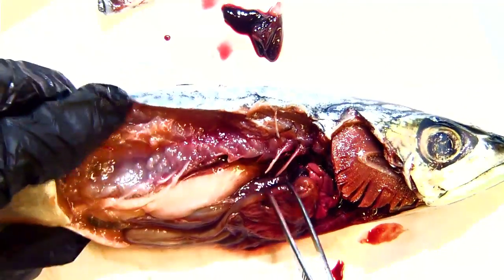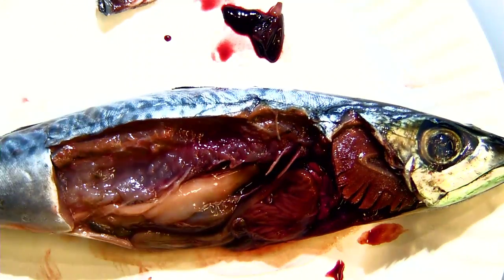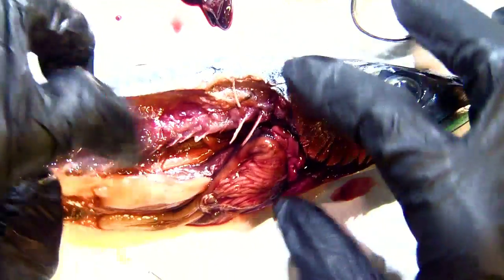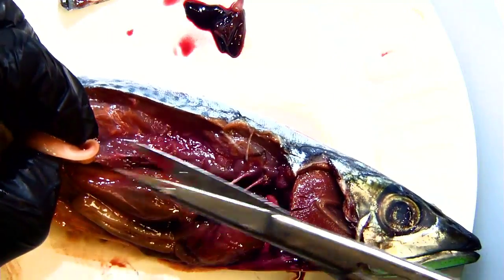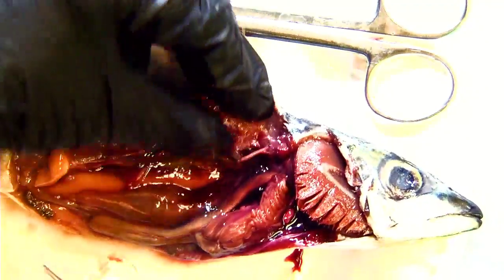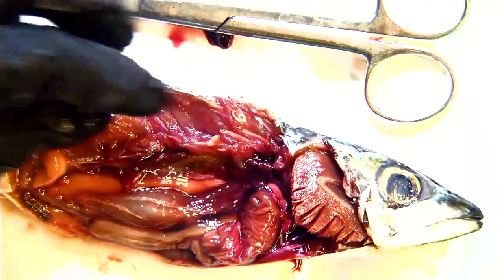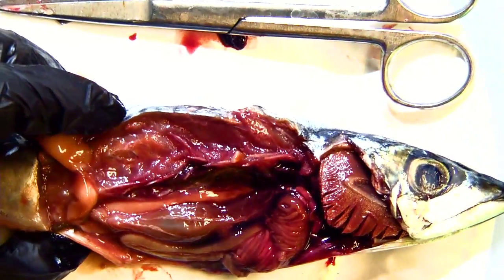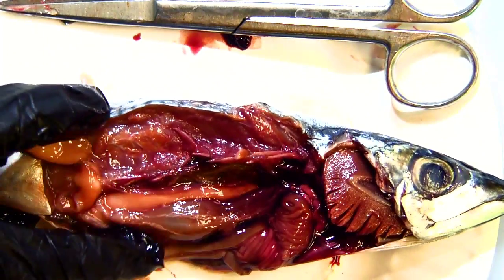These fish don't need to worry about buoyancy the same way - they have something else: an air bladder or swim bladder. This right here is a spleen. Moving that out of the way, back up here there's this shiny, iridescent thing - this is the air bladder or swim bladder that allows the fish to actually float. It brings gas in so the fish can rise and float in the water, or it can let it out so the fish can sink a little lower.